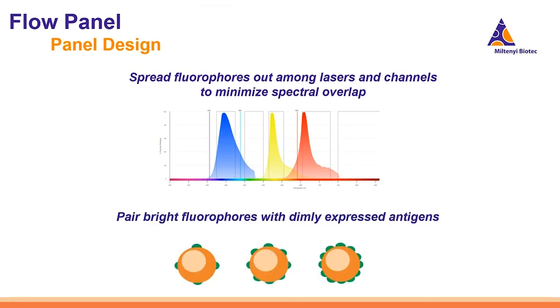Another concept is to just pair your bright fluorophores with your dimly expressed antigens. This pairing process up front can help make more robust panels over time.